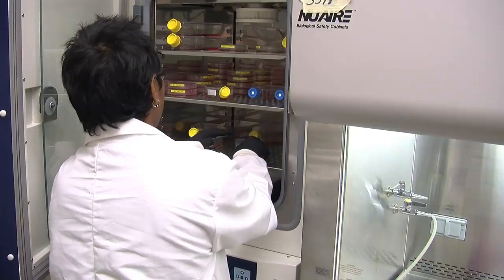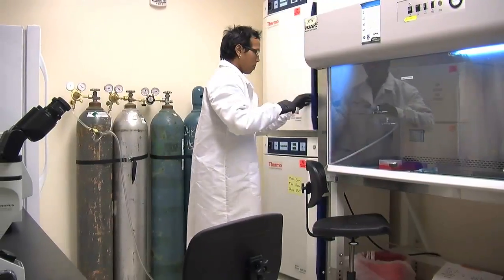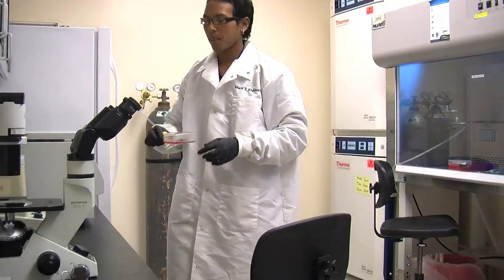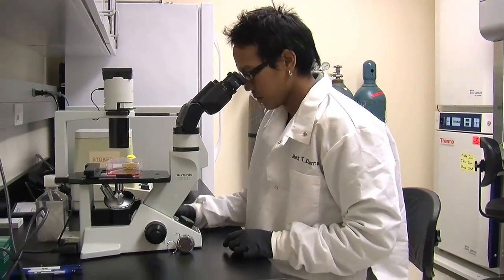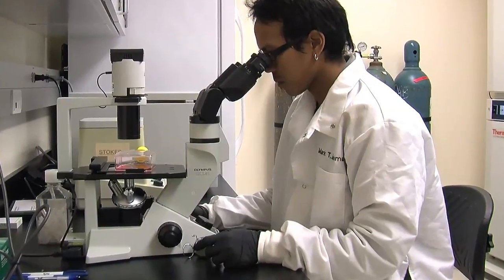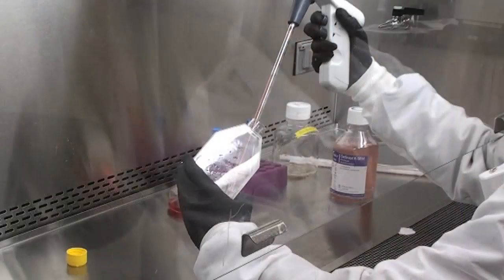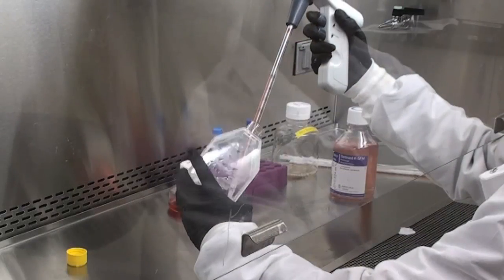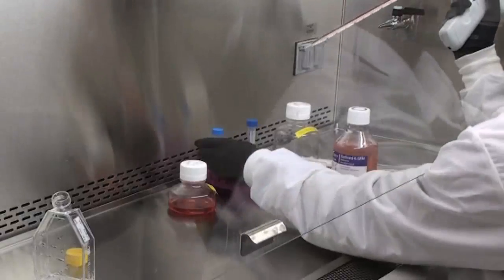After 2-3 minutes, take the flask from the incubator and rock the flask back and forth. It's sometimes possible to see the cells dislodge with the naked eye. Otherwise, place the flask back under the microscope. If cells remain adherent, it might be necessary to forcefully dislodge them by hitting the outside of the flask. Once dislodged, resuspend cells with additional media and transfer the cell suspension into a new 15-milliliter centrifuge tube.